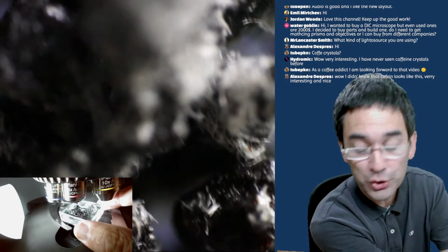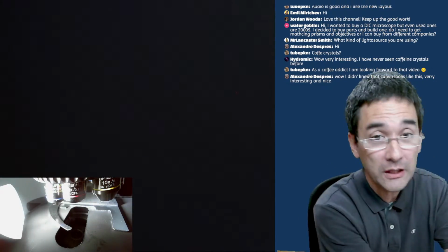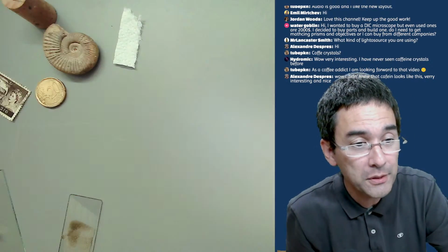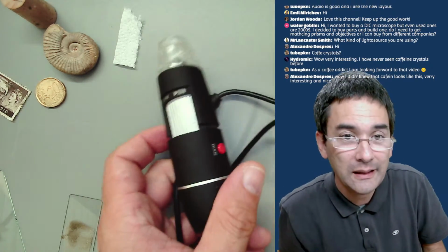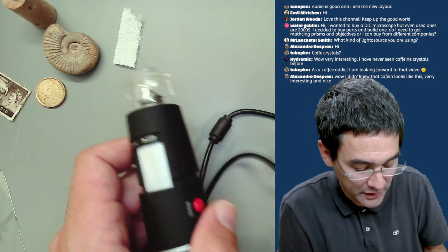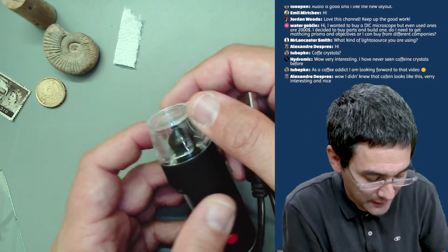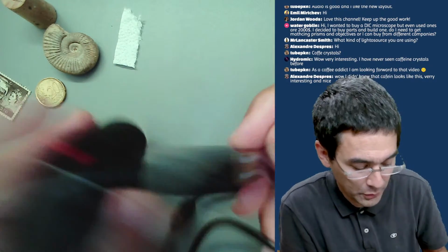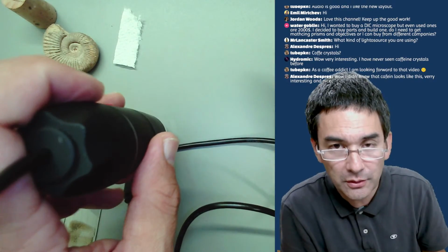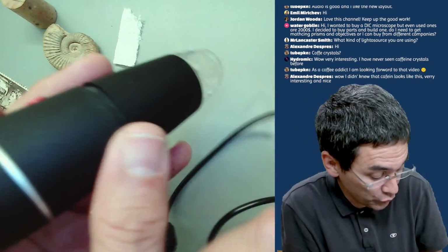So I also want to show you something else, just so that you have seen it, but unfortunately, I could not connect it to my computer. If you want to look at what I've got here, this is also a so-called USB microscope. Actually, it's not a real microscope. It's called a microscope, but what it actually contains is a lens, and then you're able to put it over certain objects. There are LEDs here, and then you are able to get a picture into the computer and see it. I wanted to show this to you, but I couldn't for whatever reason.